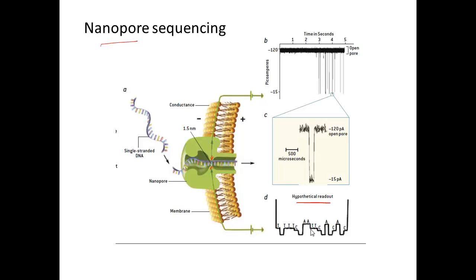Whether this method would ever become competitive with some of the other methods that we've shown remains to be seen, but it would be wonderfully complementary if it would, with the long reads and the comparatively very fast sequencing times.